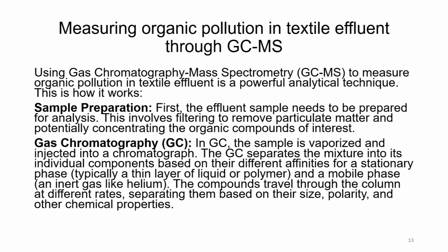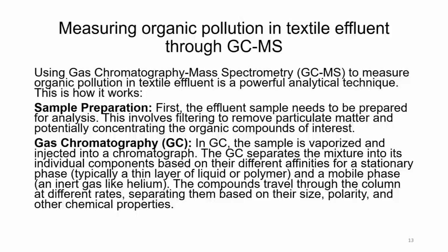Measuring organic pollution in textile effluent through GCMS. This analytical method we had not dealt in detail. Using gas chromatography mass spectrometry, that is GCMS, to measure organic pollution in textile effluent is a powerful analytical technique, and this is how it works.